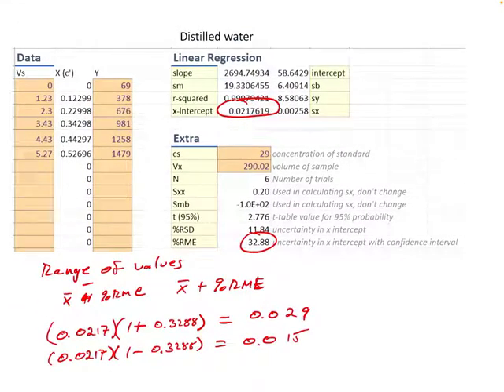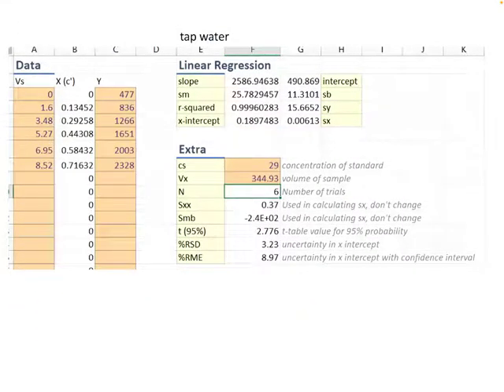I'm going to try to. There we are. Okay. This is for the tap water. We've got the salinity of the tap water and the error of the tap water. So let's go ahead and figure out our range. I'm going to use 4 decimal places for this one, just to make sure that we get a good difference. We'll avoid any round-off errors. 1 minus 0.0897.